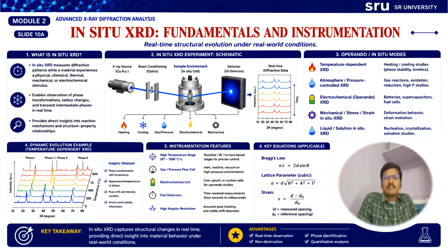This makes in situ XRD extremely useful in battery research, photocatalysis, fuel cells, shape memory alloys, thin films, and catalytic materials.